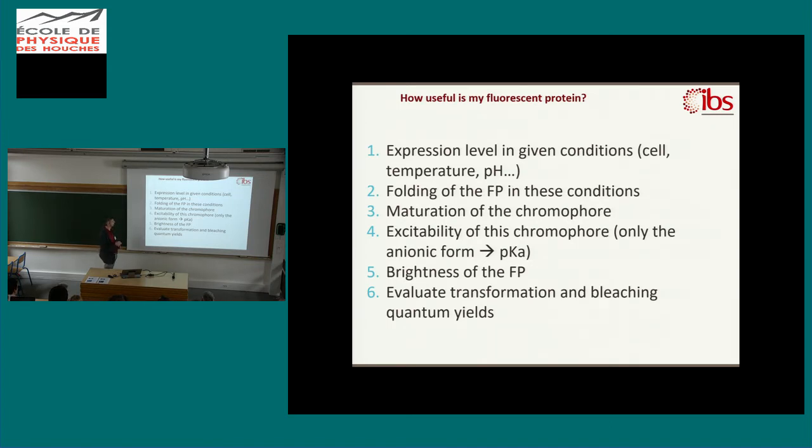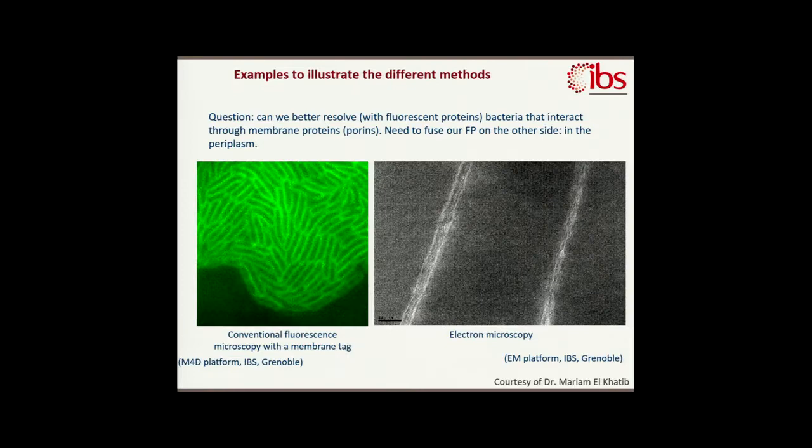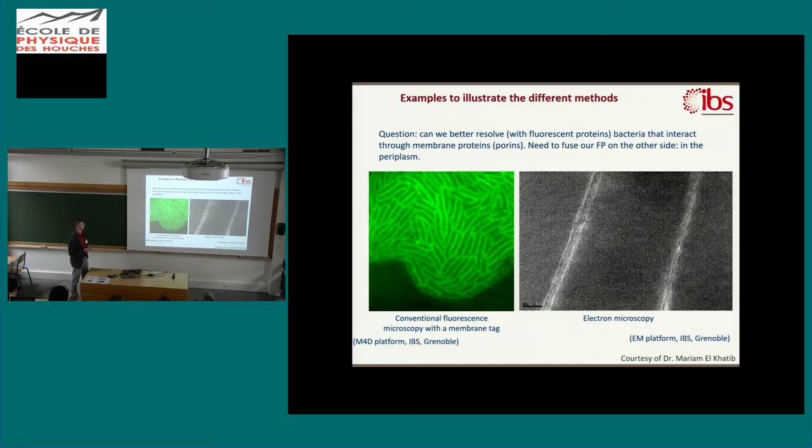So everyone told you that it's important to take care of the maturation and the folding, but how do you measure them? I will illustrate my presentation with this example where we made the most of everything. It's a protein we were interested in developing because we wanted to see interactions between bacteria that interact directly with one another through porins, so through membrane proteins. And since they were interacting physically, we couldn't put fluorescent proteins on the external side. So we had to put it on the other side, within the bacteria but between the two membranes. It's a gram-negative bacterium, so we had to put it within the periplasm.